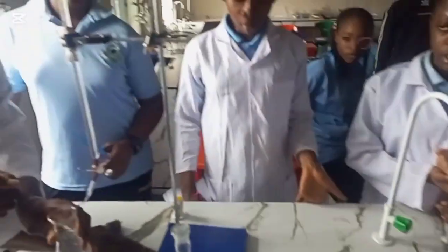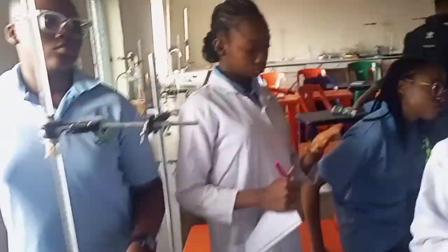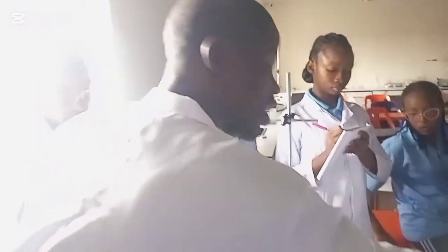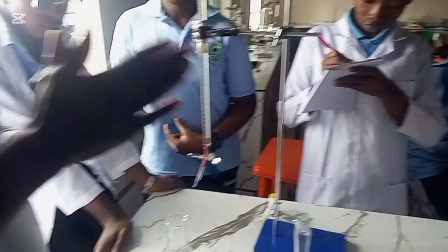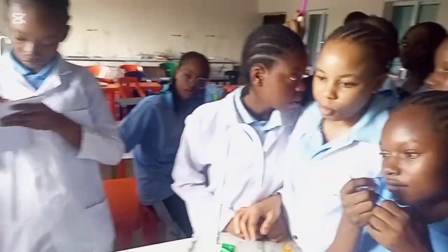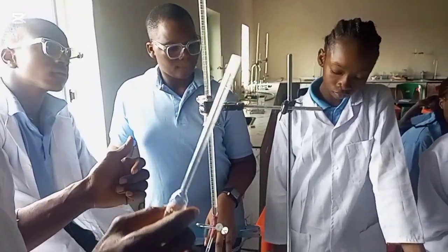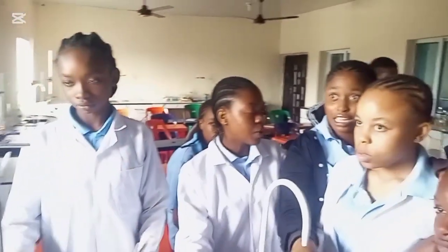The reading: write 0.00, and under it you write the reading, 4.4. The reaction is a chemical reaction. We do the titration with phenolphthalein indicator 3 times.